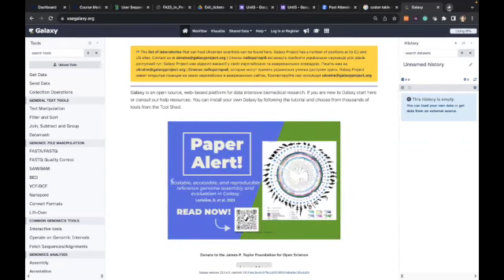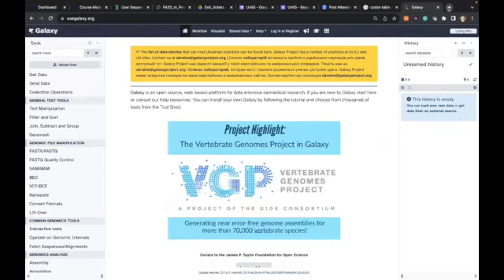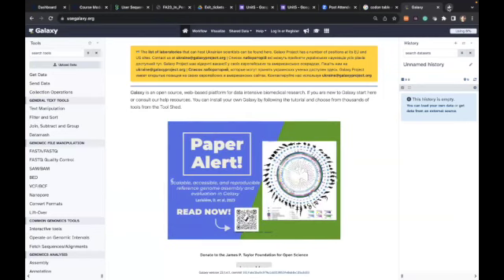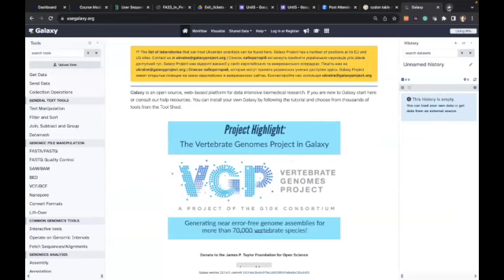There's only one more choice. If you have $8,000, you can license the commercial version of GUI, graphical user interface, software such as Partek Flow or those kinds of things. Usually your institute may not try that. So that's basically the overview of Galaxy.